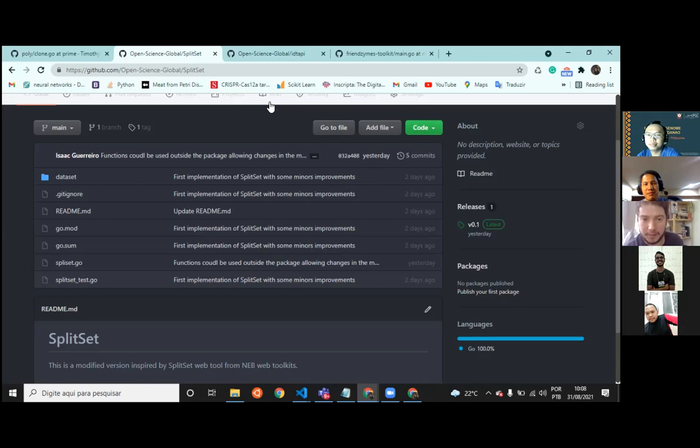For the nanopore sequencing, the other part of the project, my main goal here is trying to see the software that you created for pipelining the reads. Isaac, Scott and Ahmed, who are working in the laboratory, know the protocols for sequencing some samples, but they don't know how to do the in silico step of how you receive the reads and how you produce a final sequence with this.